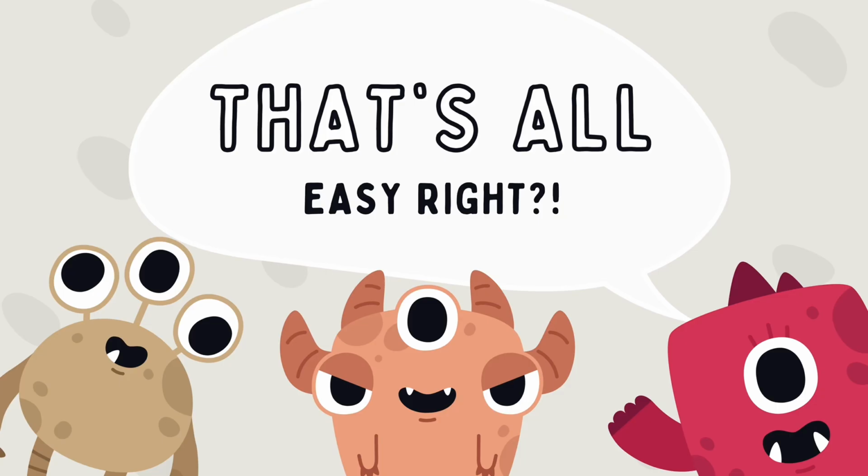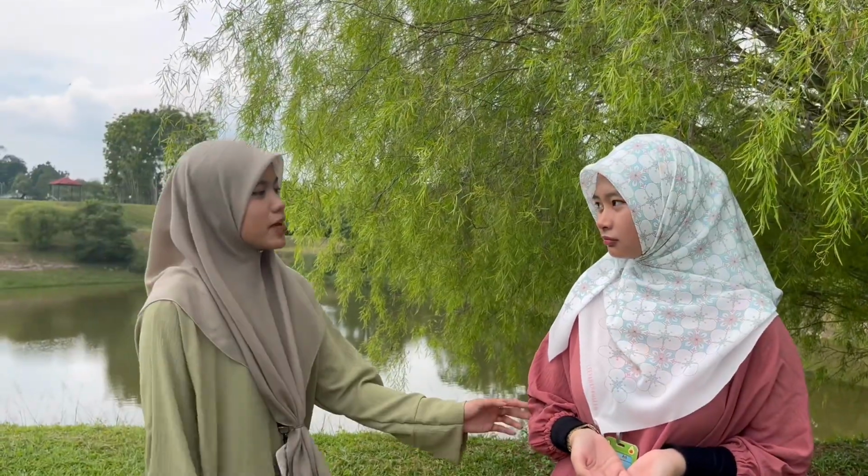That is all. Easy, right? Wow, how do you guys know all those things? Actually, Iman and I just did the experiment last week. Do you guys want to know the result?